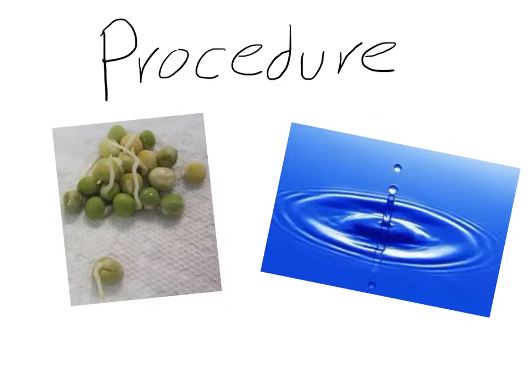A timer was used also for 12 minutes at intervals of 2 minutes. We would take the measurement of each respirometer and record it.